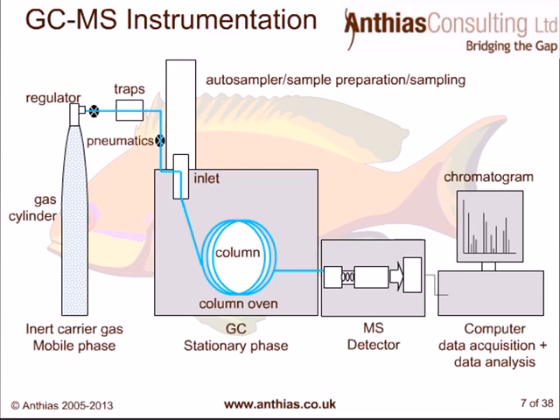And when we're thinking about sensitivity, there's two parts to that. There's signal and there's noise. So we always want to enhance our signal, but at the same time, we want to think about reducing our noise to get our best signal to noise level. So therefore, high purity carrier gas is one of those ways of reducing our noise, depending on the type of detector we're actually using, whether it's a GC detector or a mass selective detector.